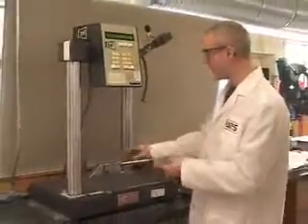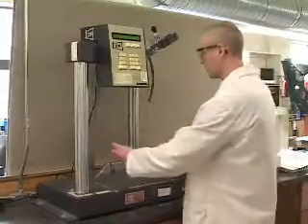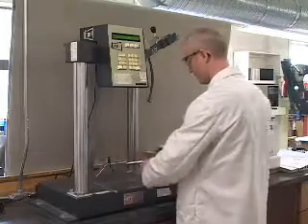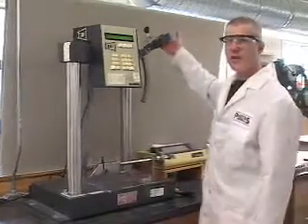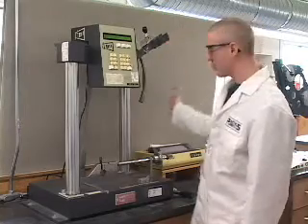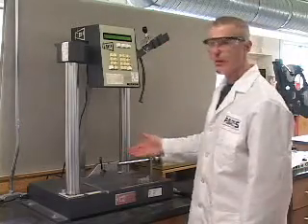The bar is mounted in a test vise and a pendulum with a specified available energy is swung through the specimen to break the specimen.